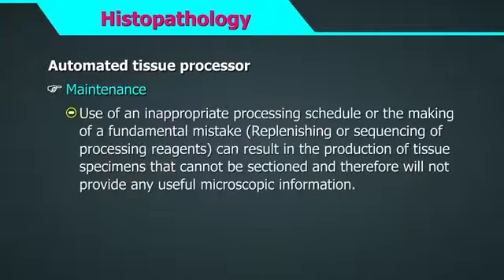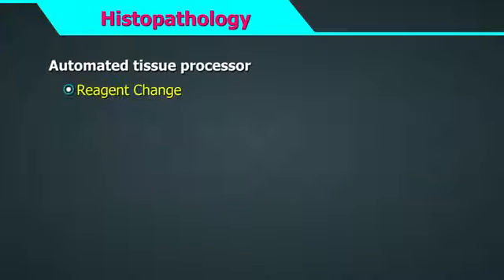Maintenance. Use of an inappropriate processing schedule or the making of a fundamental mistake, perhaps in replenishing or sequencing of processing reagents, can result in the production of tissue specimens that cannot be sectioned and therefore will not provide any useful microscopic information. Reagent change.